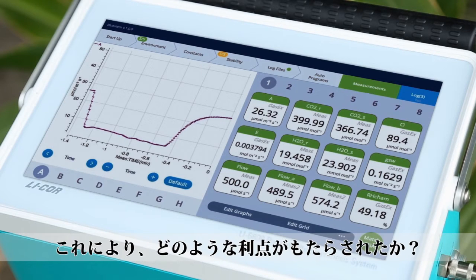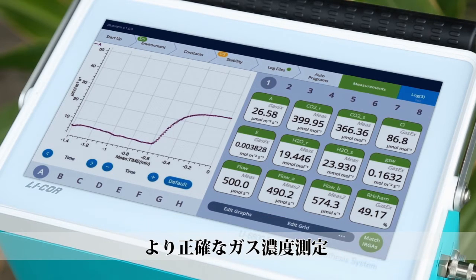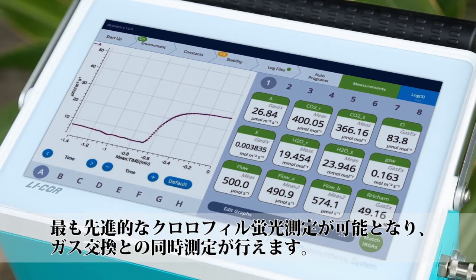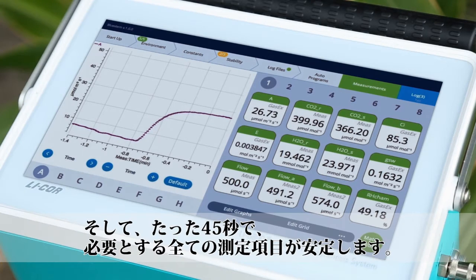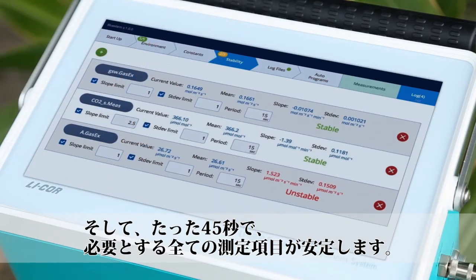What does this bring you? Fully automated control of the leaf chamber environment, including water vapor. Gas concentration measurements that are more accurate. The most advanced fluorometer and gas exchange system available. And, as you can see here, survey measurements that reach stability in as little as 45 seconds.